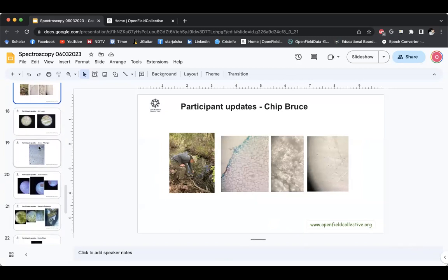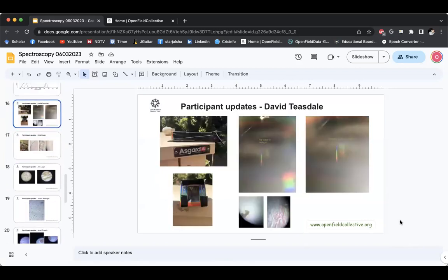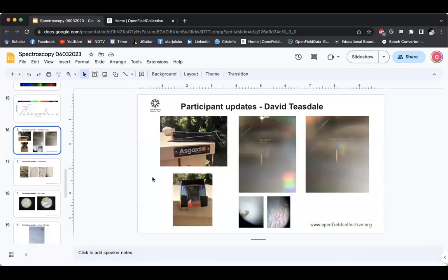Yeah. I had one point. Can you go back to David's slide with the spectrophotometer? So these pictures, I think there is also a lot of sunlight from where you are taking the picture, right? So this was not done in a room or something.